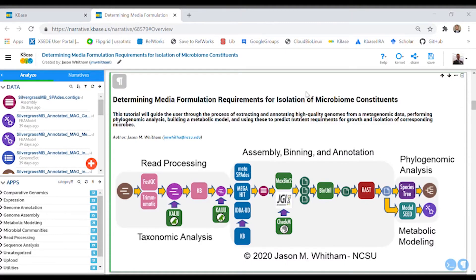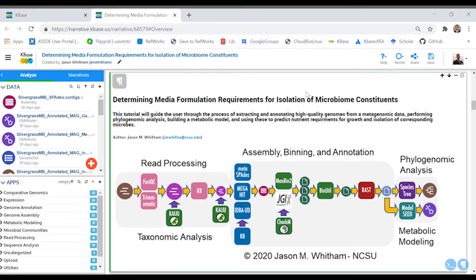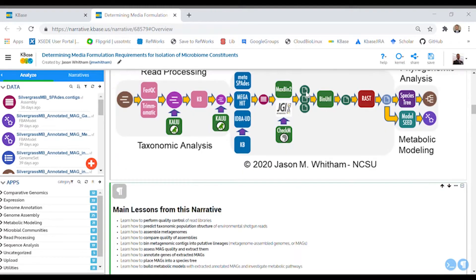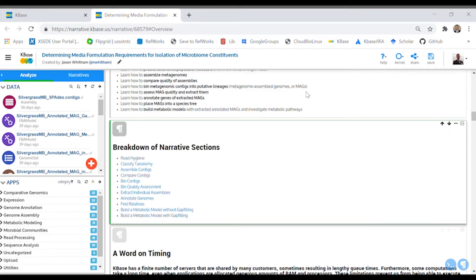In this summary cell, you'll see the full workflow from uploading next-generation sequencing reads to read processing, assembly, binning, annotation, phylogenomic analysis, and metabolic modeling. A main lesson cell further breaks down these tasks, and the following cell provides hyperlinks to different sections of the narrative.